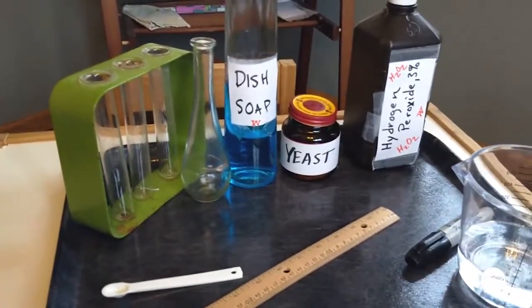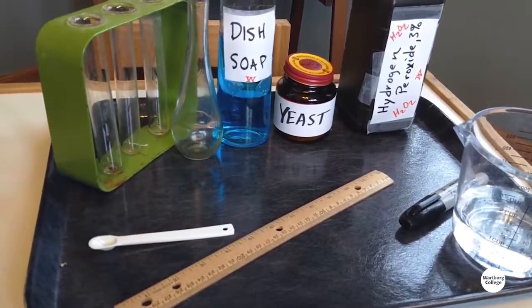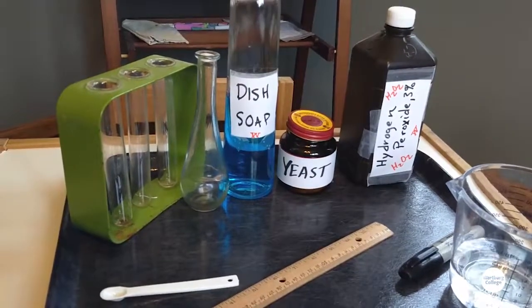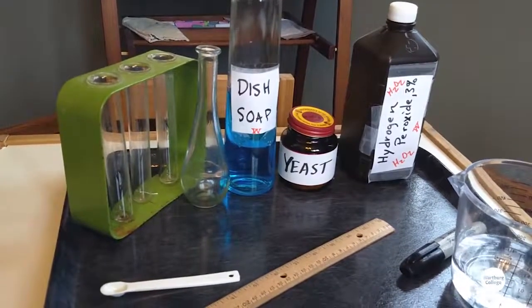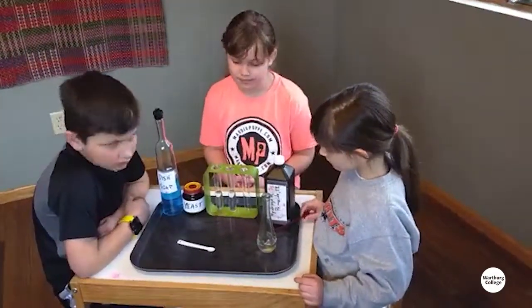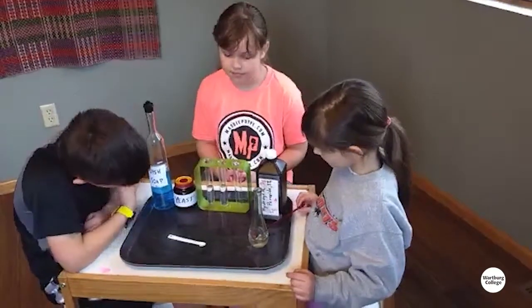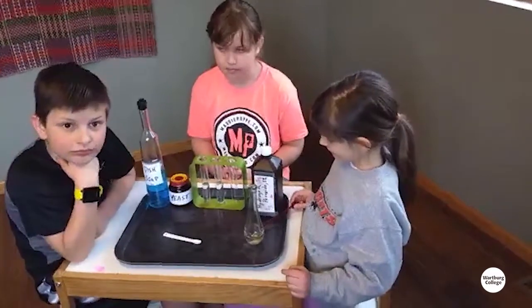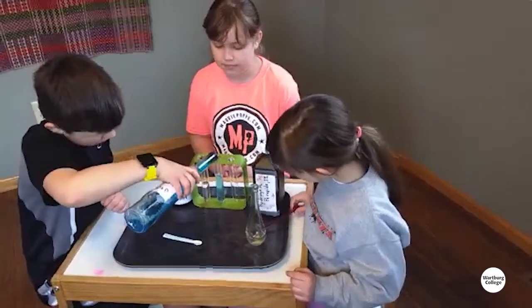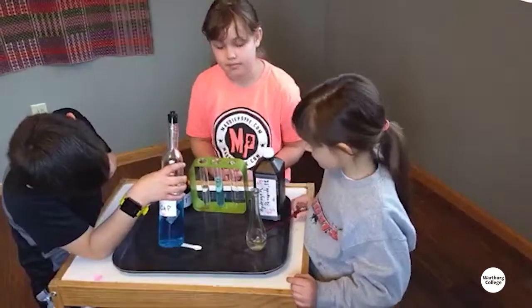If you want to up this into more of an experiment, we can start looking at variables you can change. Things that might be helpful are a measuring spoon to measure exactly how much yeast you're using, a ruler to measure how high the bubbles get under different conditions, and a Sharpie to mark your glassware. Those are other ways to make this a little more sciencey — making sure that we keep some variables consistent, like how much soap, how much yeast, and how much hydrogen peroxide you put in each time. So you put some hydrogen peroxide in there — you can put however much you want or however little you want. Once you've put some hydrogen peroxide in, go ahead and add some dish soap.